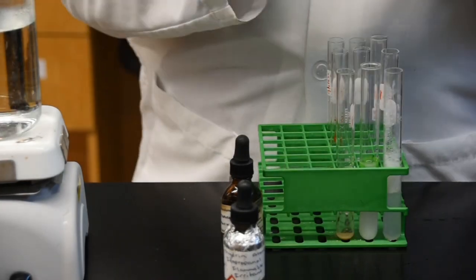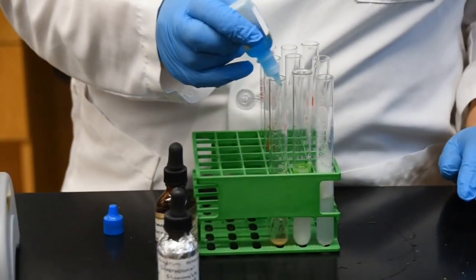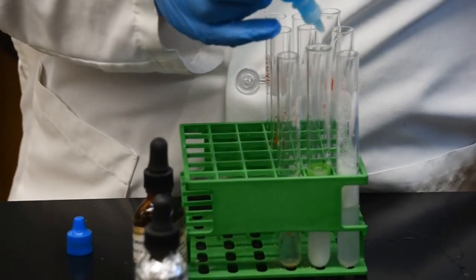So here we go. I'm going to start my samples. I'm going to add a few drops of my Benedict solution to each of these.